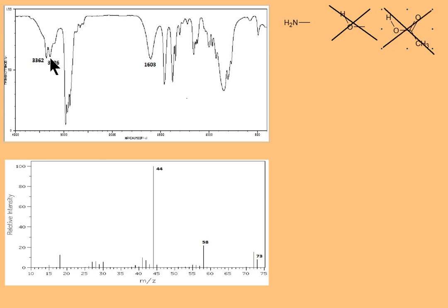It doesn't form into a crab claw, and even if it did, it's in the wrong region. The OH stretch for a carboxylic acid imprints over the top of the CH stretches for an alkane. So it's the wrong shape and we're in the wrong position. So it can only really be an amine with those peaks in the 3300 to 3200 range.